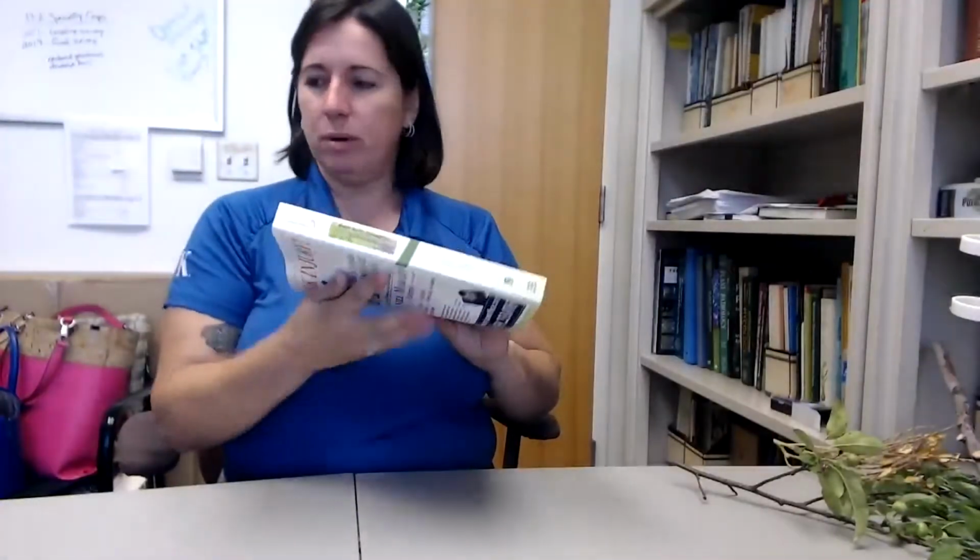Don't forget, though, if you have multiple samples, to put a Post-it note sticking out on which ones it is. Don't think you're going to remember, because you don't. In fact, this phone book I found on my shelf, it's strawberries, but I don't know what's going on here. I forgot to label them, so don't do as I do. But phone books and deli containers are some of the best tools that you can have in your office, and that will get you pressed leaves.